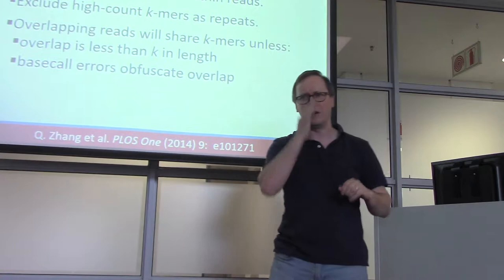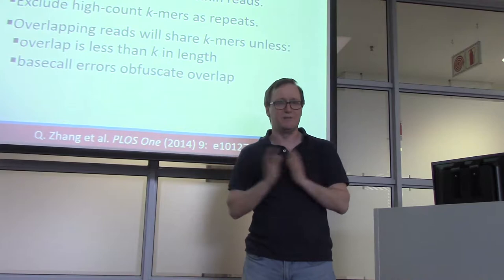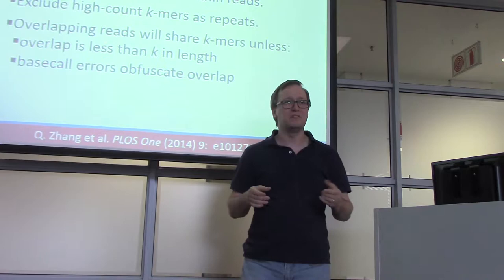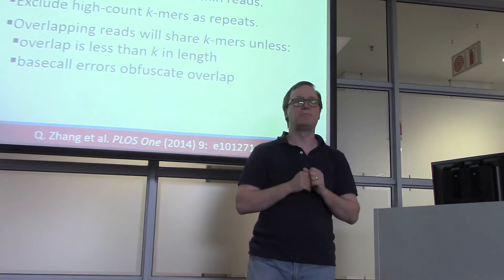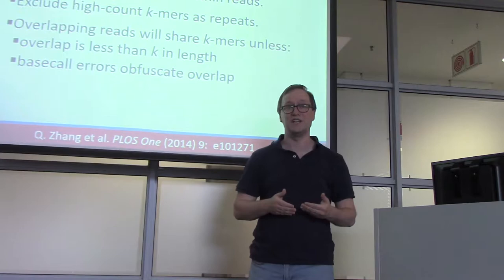This is kind of a complex thing. So let us say that we want to find which sequences overlap with a sequencing read. If you have 100 sequences, that's pretty straightforward. You can say, well, this one shares sequence with that one and with that one. I can overlap them. That's fine. But when you have millions of sequences, determining which reads overlap gets to be a really big, ugly problem. That is, in a large part, the problem of DNA assembly.